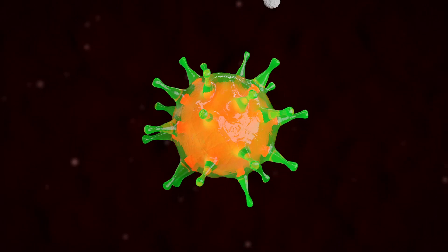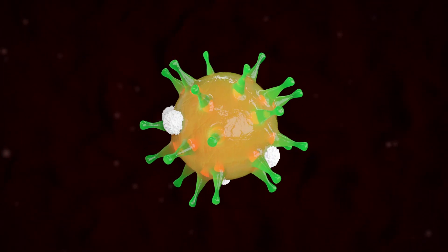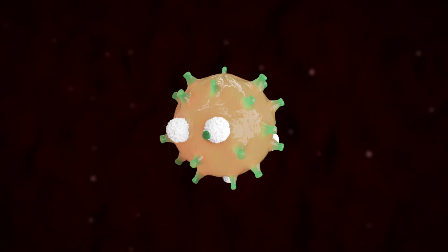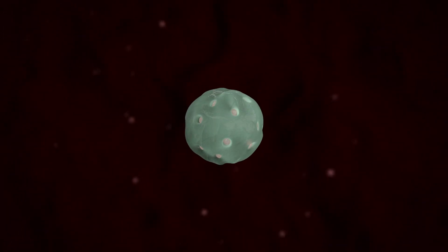White blood cells are a part of the body's immune system. They help the body fight infection and other diseases.